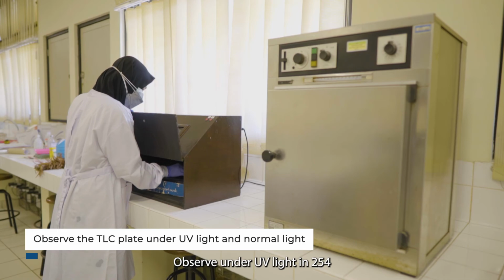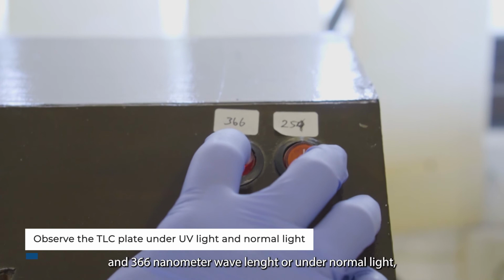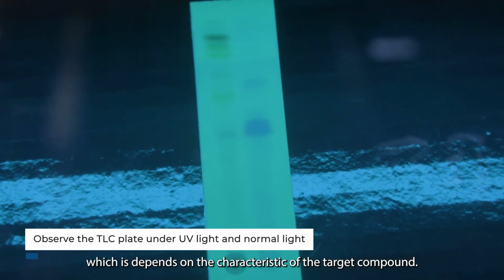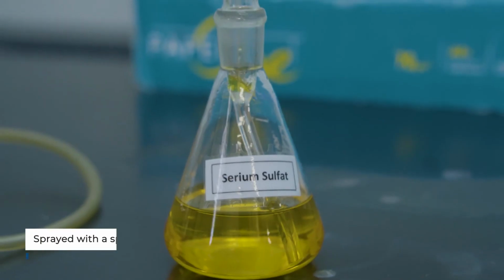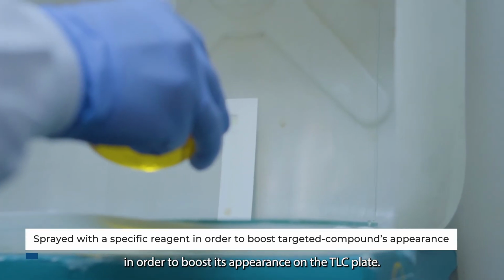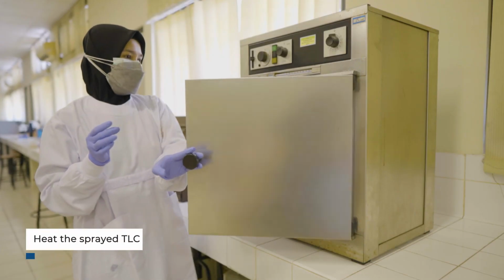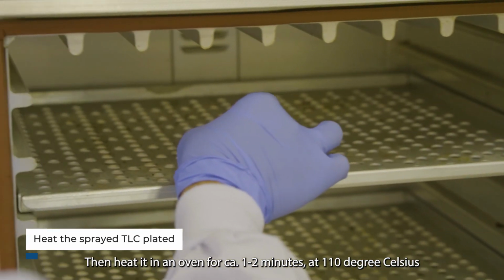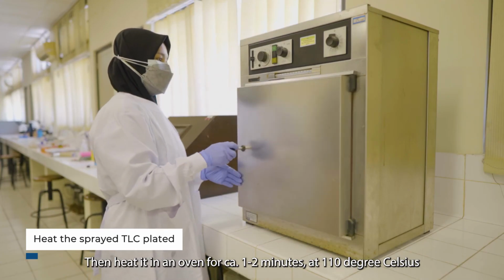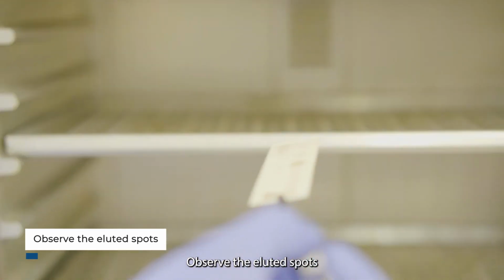Observe under UV light at 254 and 366 nanometer wavelengths or under normal light, which depends on the characteristics of the target compound. Some compounds are required to be sprayed with a specific reagent in order to boost their appearance on the TLC plate. Then, heat it in an oven for approximately 1 to 3 minutes at 110 degrees Celsius. Observe the eluted spots.